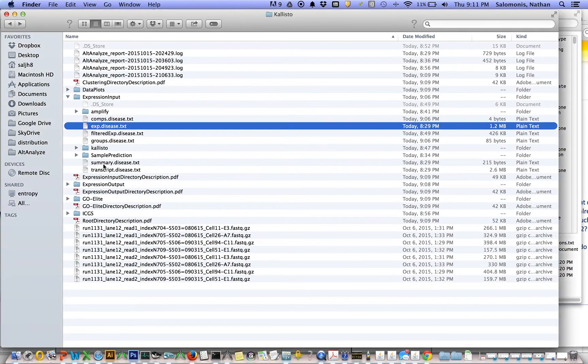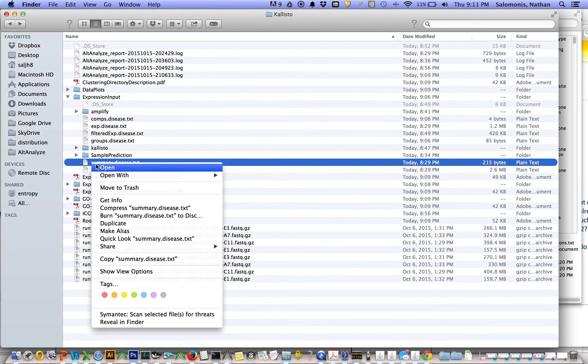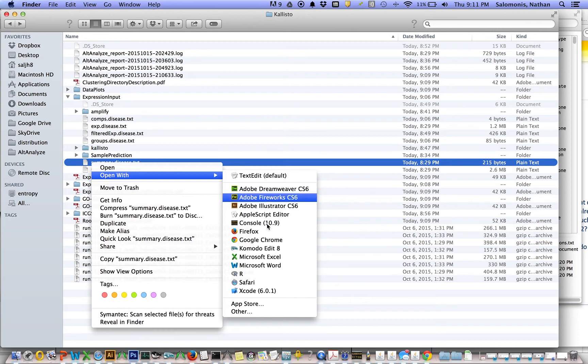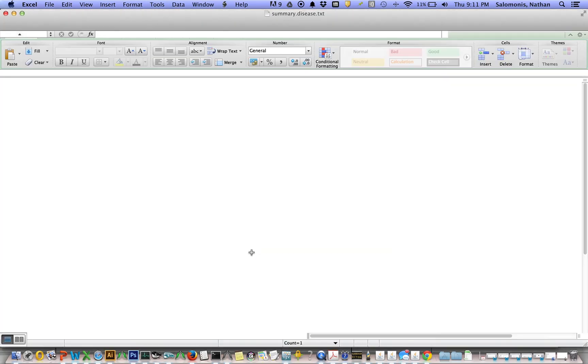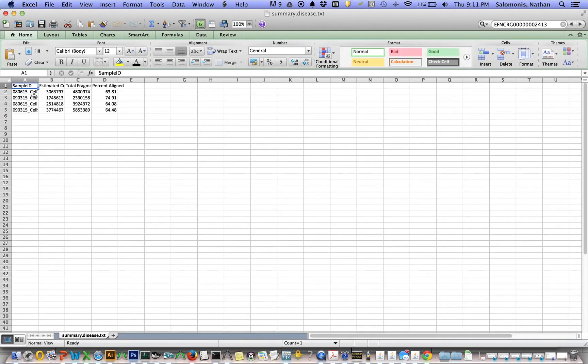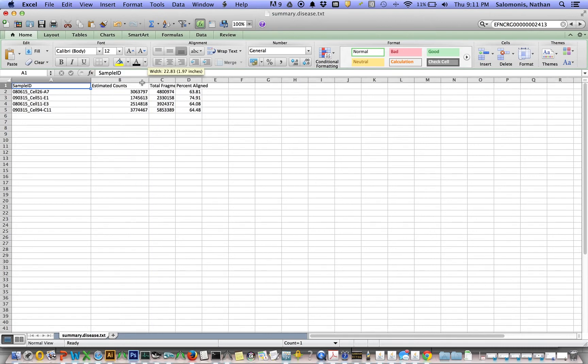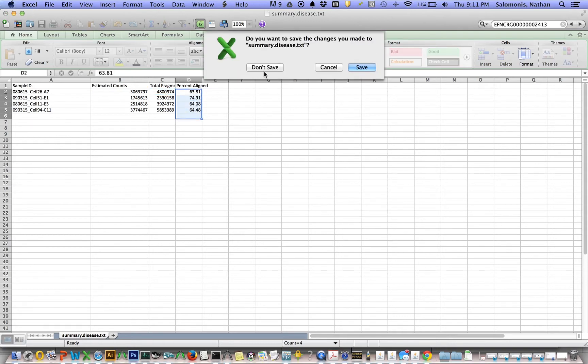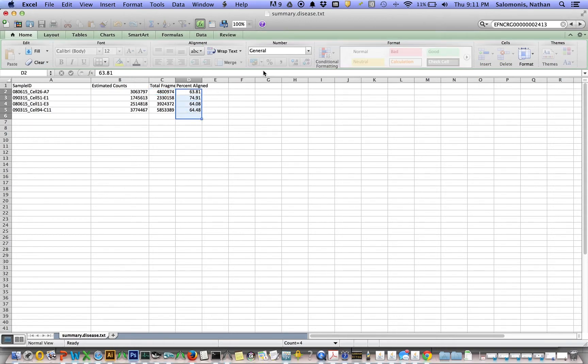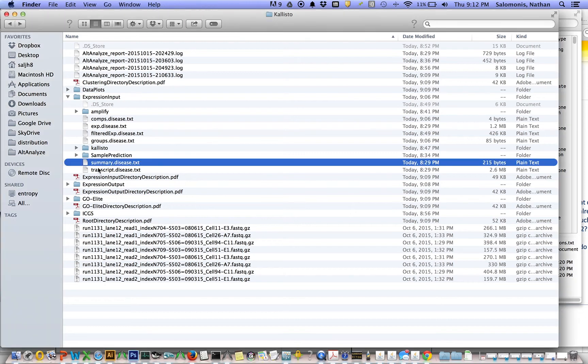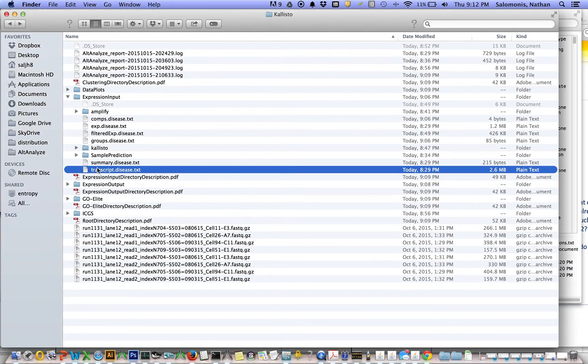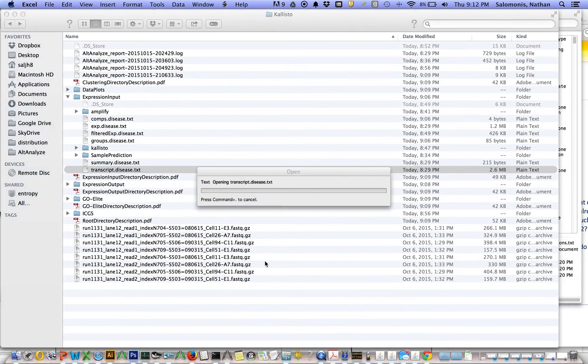You have the summary file. These are all in this folder expression input. The summary file indicates what the estimated pseudo-aligned count read numbers are in each one of these samples, the total number of reads, and the percentage of aligned reads. This is single-cell RNA-seq, so the alignment percentages tend to be lower.